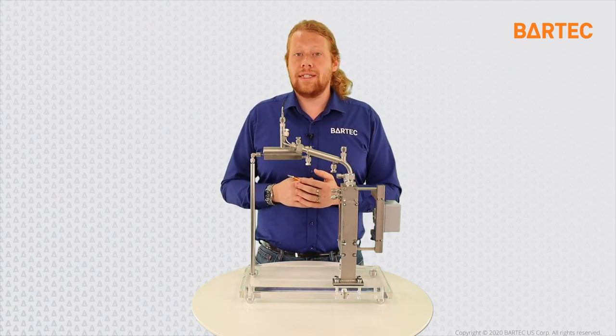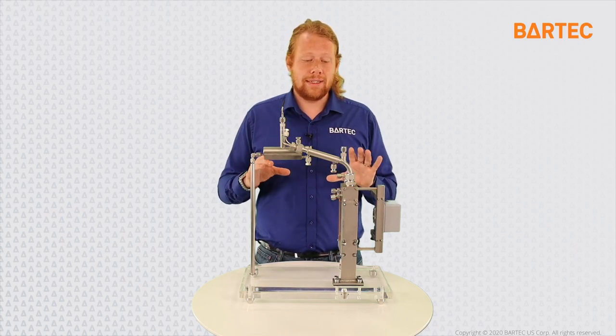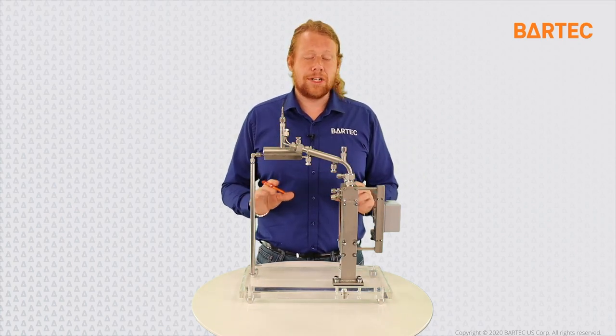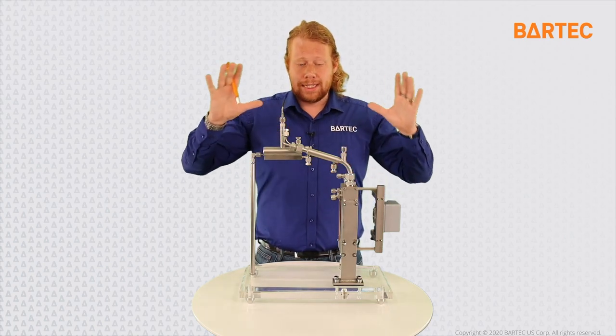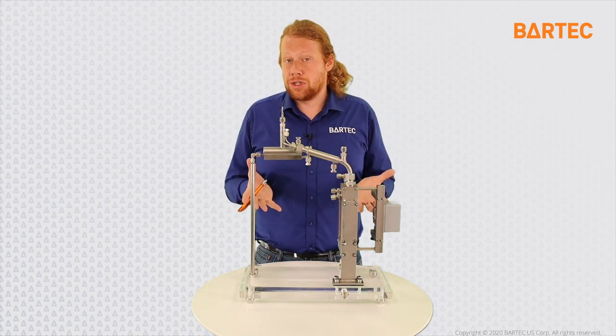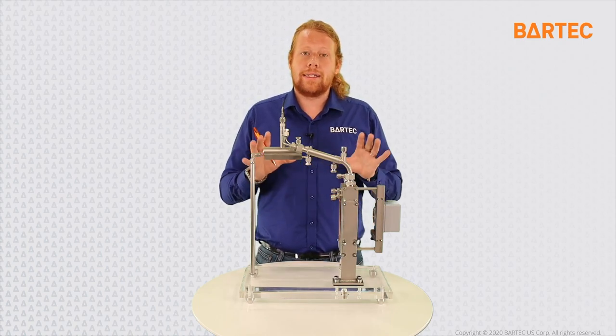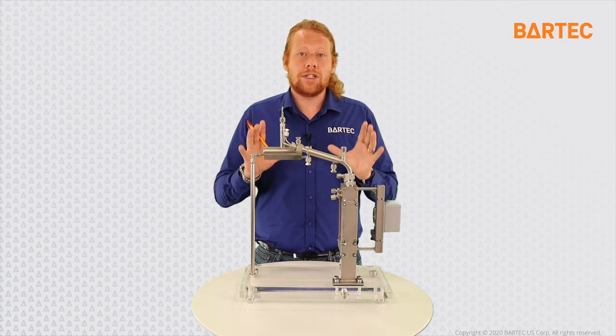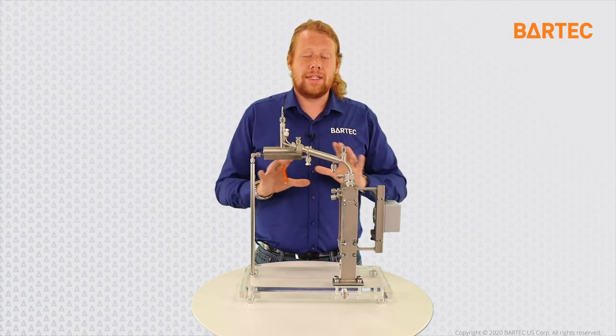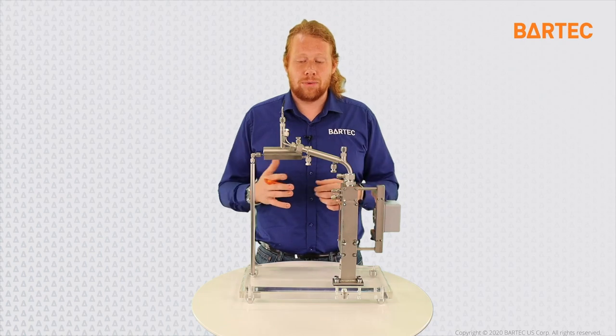So with this difference clarified, let me dive into this measurement unit, which is a subsection, a part of the entire analyzer. It's really a show unit, as we call it, and that is going to give us a good idea of what the measurement section of the rapiDist-4 is composed of and how it's working.